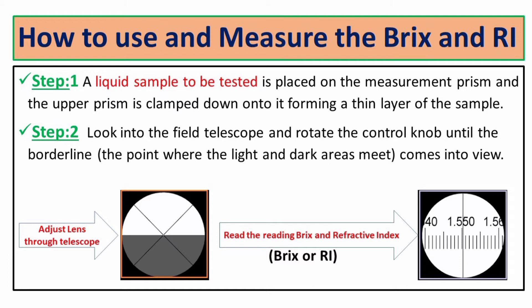Step two: look into the field telescope and rotate the control knob until the border line comes into view. When the border line comes to the center point of the cross lines, then we can note down the reading from the other telescope — that is the refractive index — and the opposite side is the brix reading.